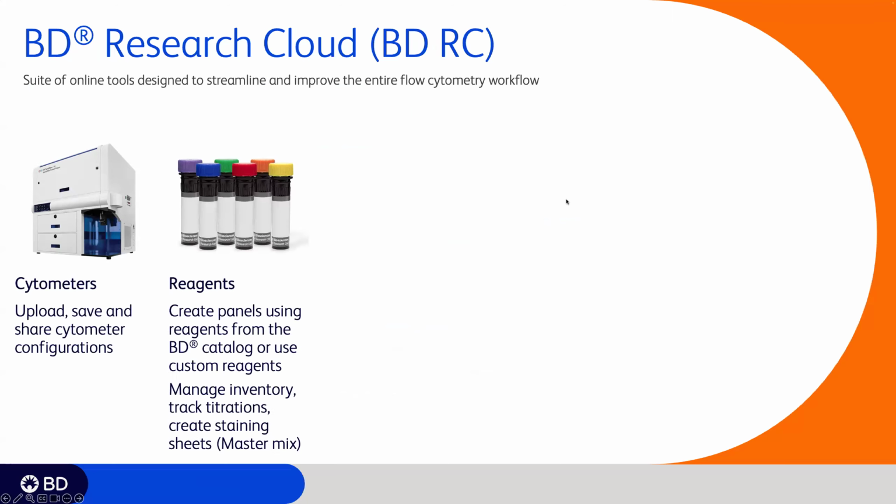You can create panels using reagents from the BD catalog, or you can create custom reagents using fluorochromes from a variety of vendors. You can manage your reagent inventory, so you know which reagents you currently have in your lab, track their titrations, and then easily create staining sheets for your panel using those reagents from your inventory and their known titration.